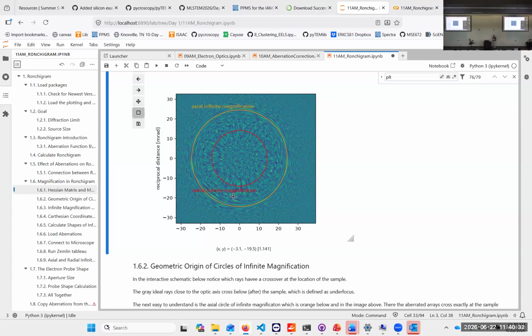And if we have an astigmatism, the defoci collapse, right? They were getting egg-like, and that's why you can directly see that. So if that is round, your astigmatism is corrected. So here we have no astigmatism.